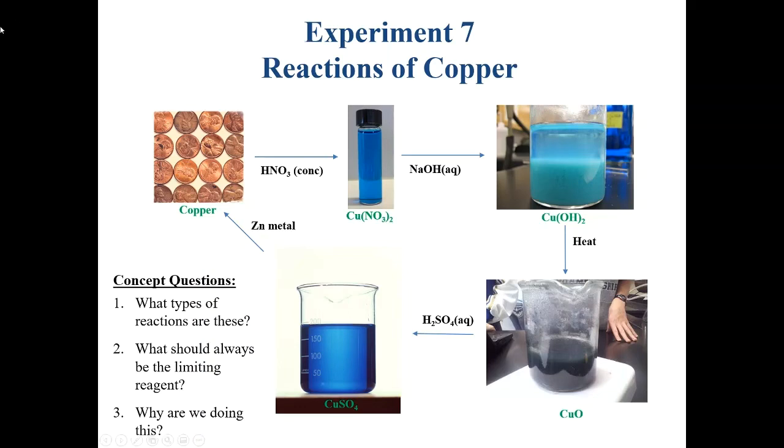So this cycle that we're taking the copper through allows us to do things like purify a metal or determine how much copper was in a sample of an unknown.